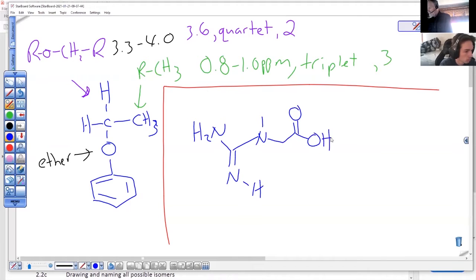Yeah, we can do all the peaks there. We'll call this one left to right. A is different than B, is different than the 3 H's on the methyl. C is different than the CH2. Now that's a special category there because it fits 2 entries on our table. It's different than E. And A would be H on a nitrogen, as is B.